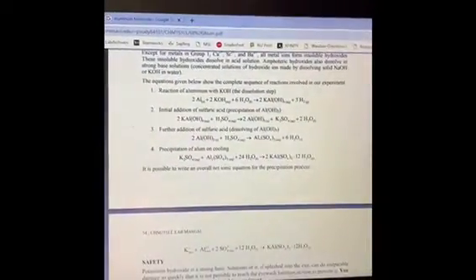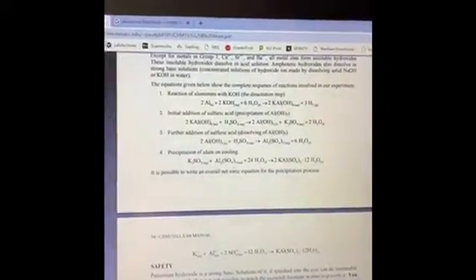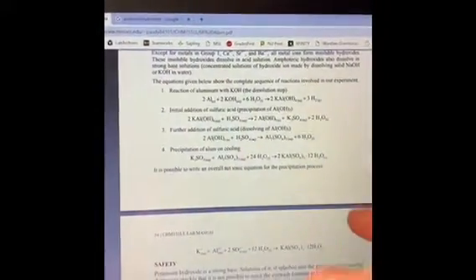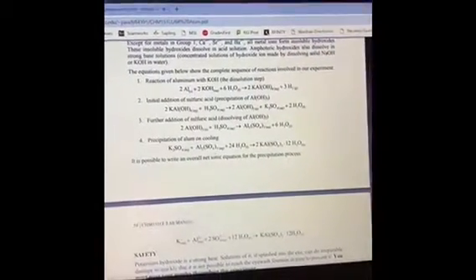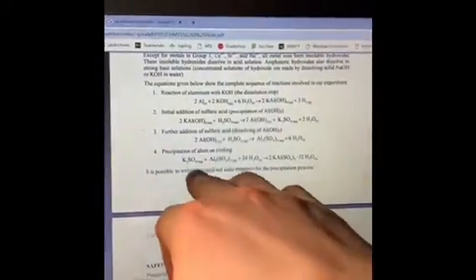The anions here then react in steps 2 and 3 with sulfuric acid. In step 2, this causes the precipitation of aluminum hydroxide. And step 3, which we merge together by just pouring all of the sulfuric acid in at one time, then neutralizes the aluminum hydroxide, and the aluminum hydroxide dissolves back into the solution. From here, we have all of these species down here in the solution.